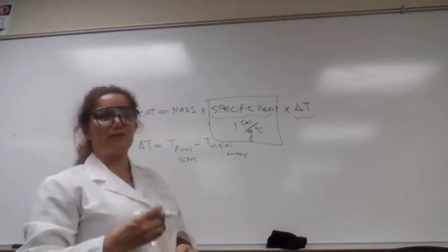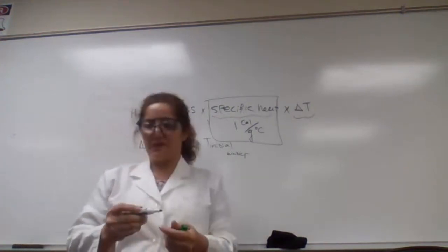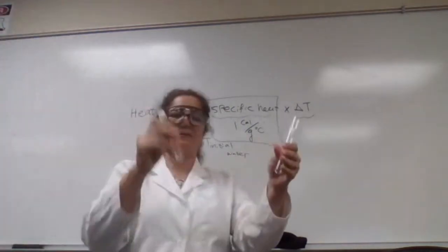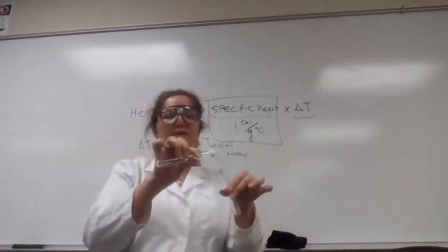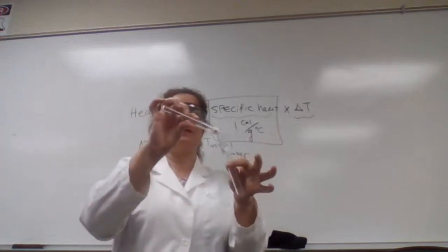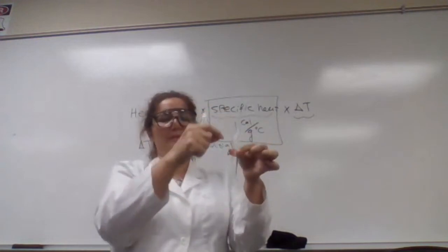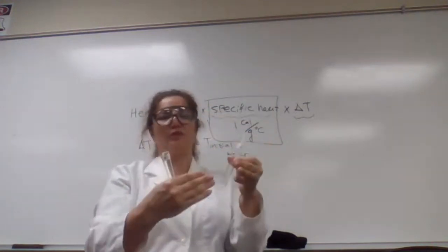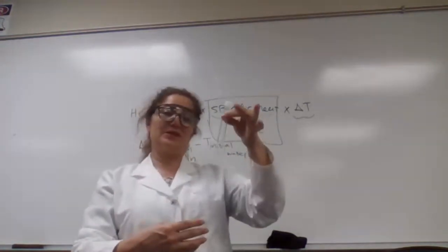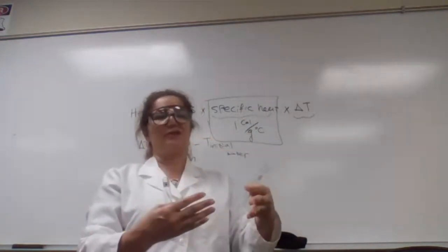We are dealing with some of the reactions that by nature are exothermic. You have 2 test tubes, let's say with chemical A and chemical B. You mix them together. Both of them are at room temperature, 25 degrees Celsius. After the chemical reaction takes place, you measure the temperature. It goes up from 25 to 40 degrees, or 38 degrees. So if the temperature increases, we define that reaction as an exothermic reaction.